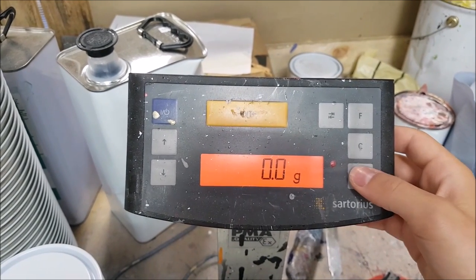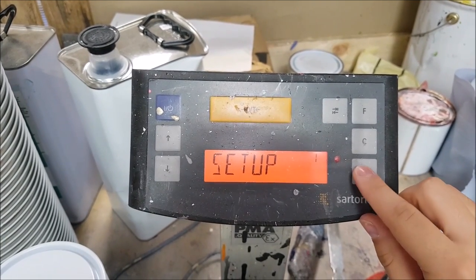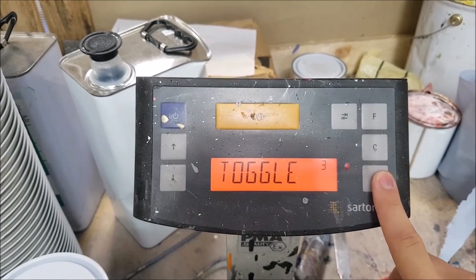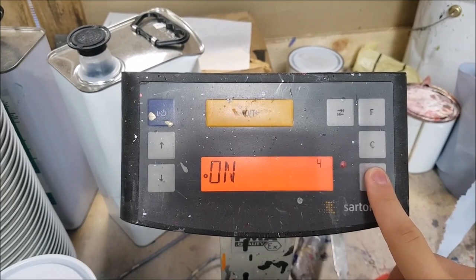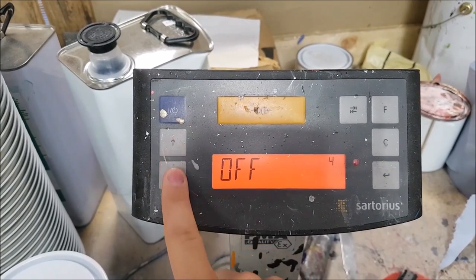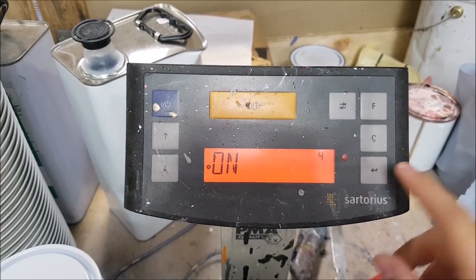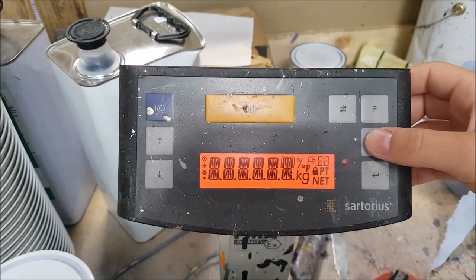First, press and hold enter for 3 seconds until setup appears, then press enter again. Scroll down to application, press enter, then go to toggle and make sure toggle is on. Use the up and down buttons to turn it on or off — when it's on you'll see a little dot next to it. If it's not on, press enter to turn it on. When done, click cancel or return to go back to the main menu.